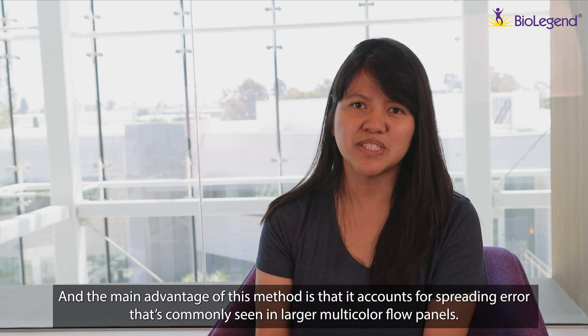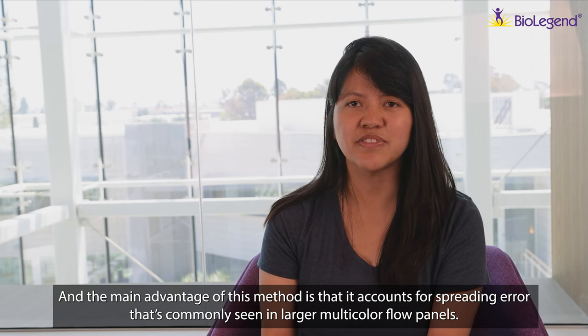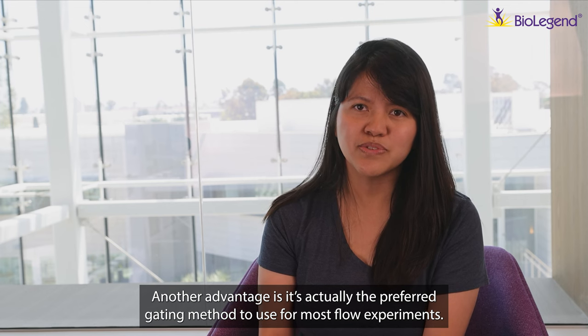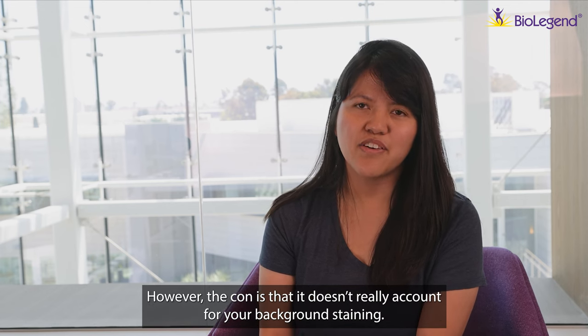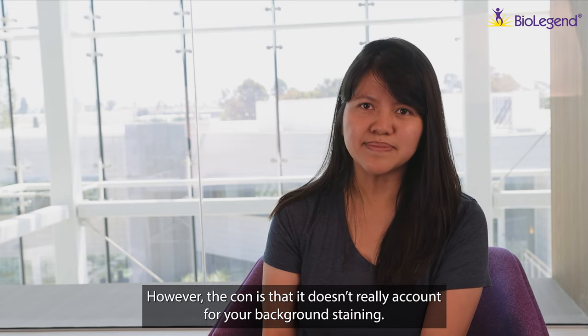And the main advantage of this method is that it accounts for spreading error that's commonly seen in larger multicolor flow panels. Another advantage is it's actually the preferred gating method to use for most flow experiments. However, the con is that it doesn't really account for your background staining.